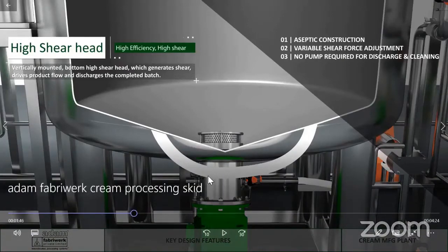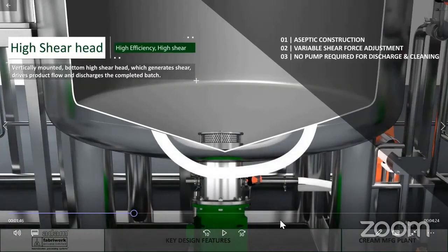The high shear head within the vessel is with a fan and screen arrangement system. It is vertically or side mounted which generates shear and drives the product flow, also discharges the batch specifically when it is in the bottom configuration. This is fitted with a variable speed drive which ensures variable shear force on the products. It ensures complete de-agglomeration of the product, and the anchor with scrapers gives a complete mix within the manufacturing vessel.